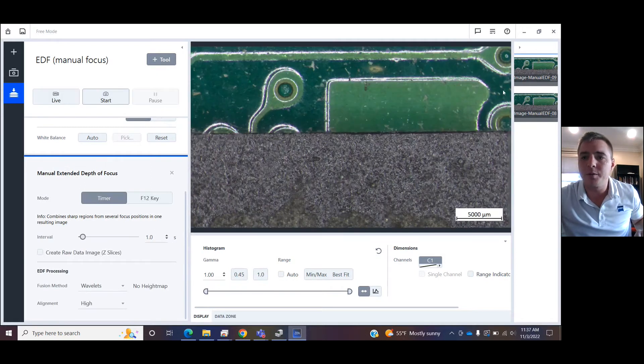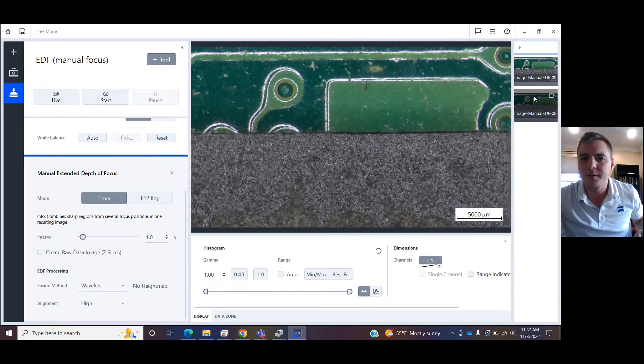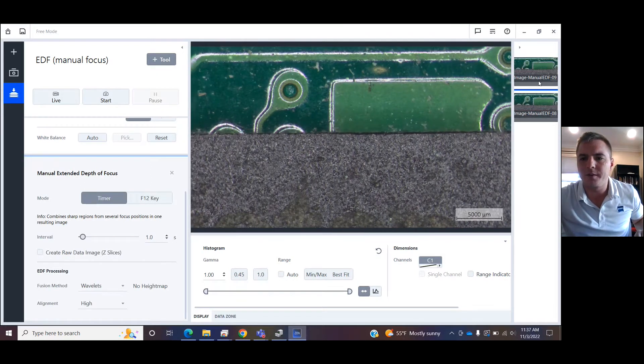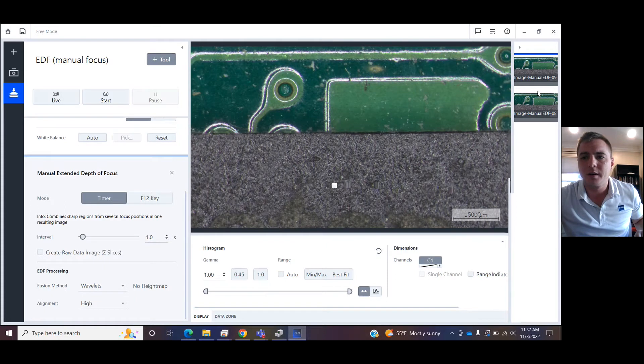Cool. So two different methods for taking an all-in-focus image available to you in the ZEN Core/ZEN Starter software.